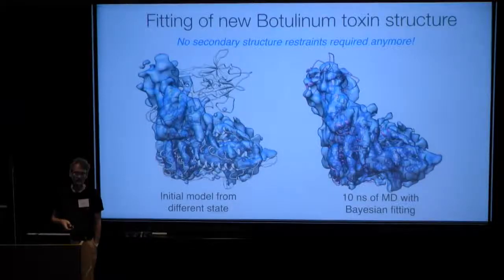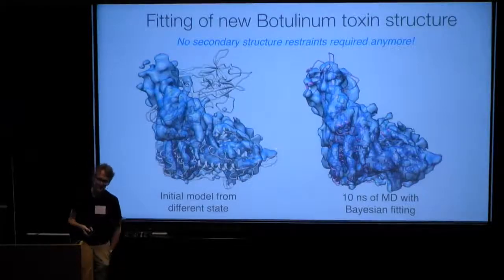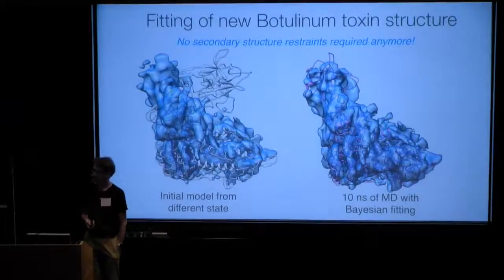It wouldn't take 1 month to build this, but we are frequently limited, even for smaller proteins, so that only the very skilled people in the group can do these things. So I would love for this to be better. I don't think it is better than the best humans yet, but the neat thing is that this takes 2 hours, and it's a computer that does it automatically.